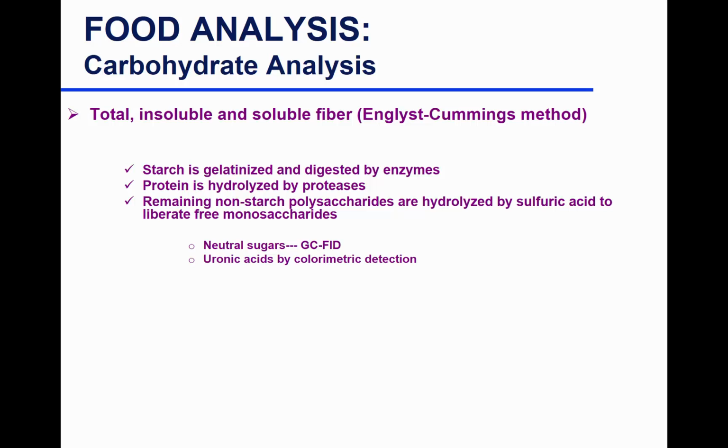So back to this, you can use GC, and in GC you can actually get the monomer forms of the different dietary fiber components you have. Again, the same preparatory step: you get rid of starch, you get rid of protein, and then you do step C, you precipitate with ethanol to get all the dietary fiber. From there, you use strong sulfuric acid to liberate monosaccharides.